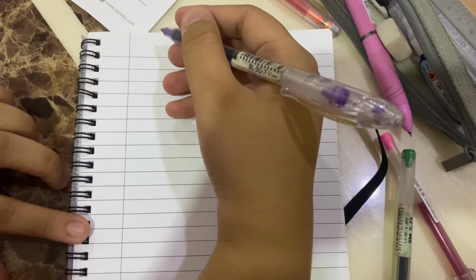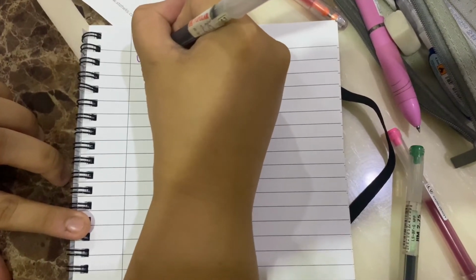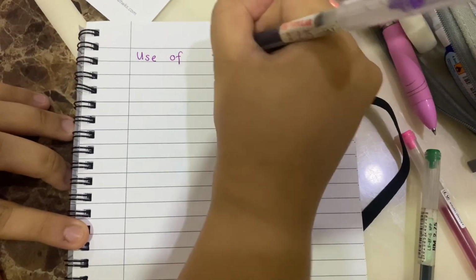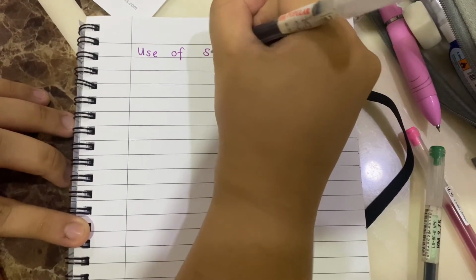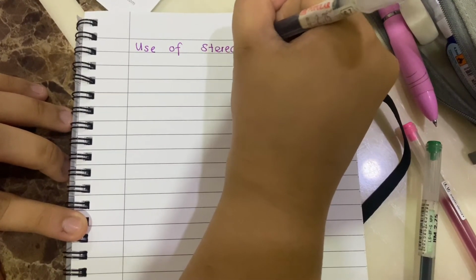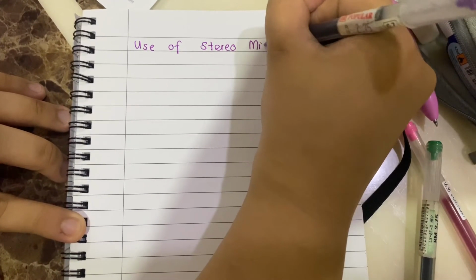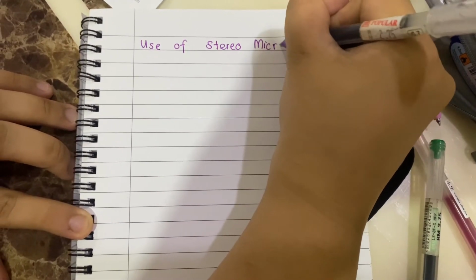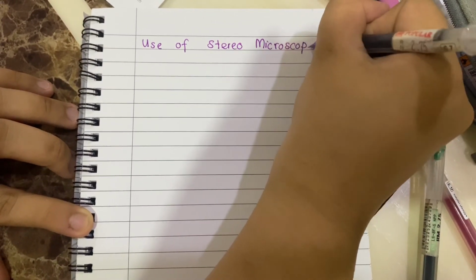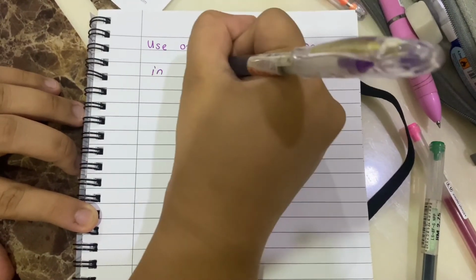Next are the uses of stereo microscope in industries. Stereo microscopes are used as quality control instruments in plastic injection molding products. They are used to inspect the physical defects of molded plastic parts. A molded plastic part usually has many edges and is required to be inspected from many different angles of view. Thus, stereo microscopes are the best instrument to view and zoom in to any critical area of a plastic molded part.